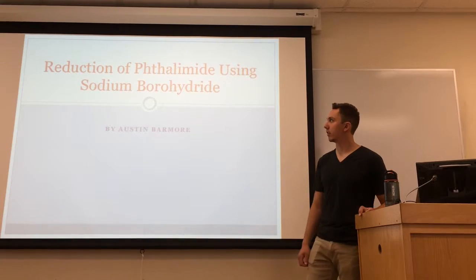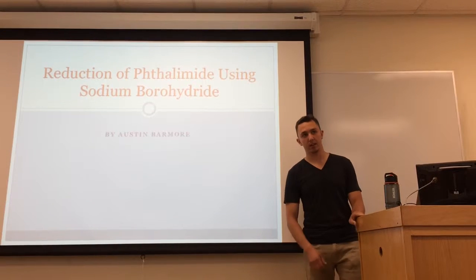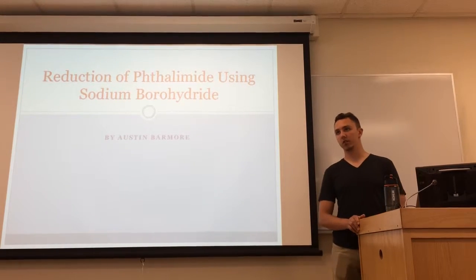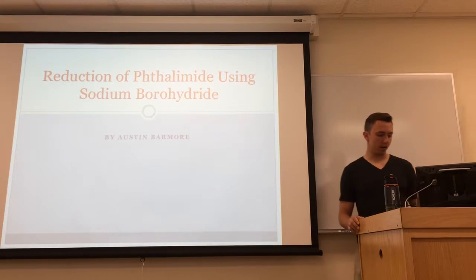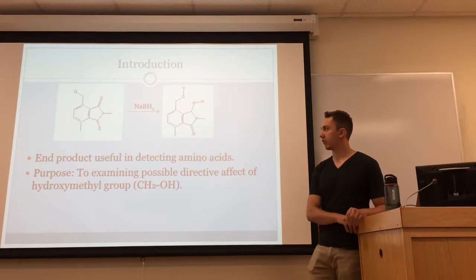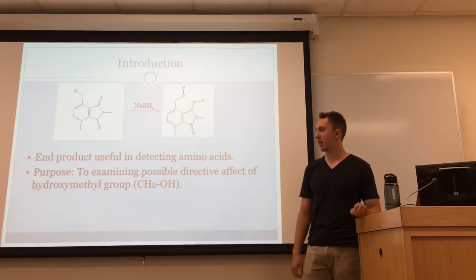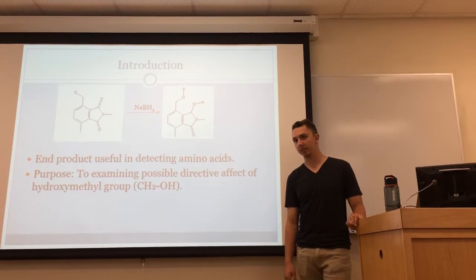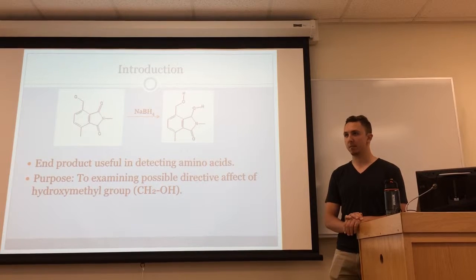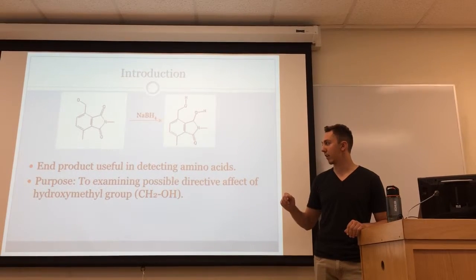Alright, so today I'm going to be telling you about reduction of a phthalimide using sodium borohydride. Just a little introduction: the end product in this entire reaction is going to be something that's useful in detecting amino acid concentrations. This is just one step in the multi-step reaction, but this is the basic highlight of the reaction up here.